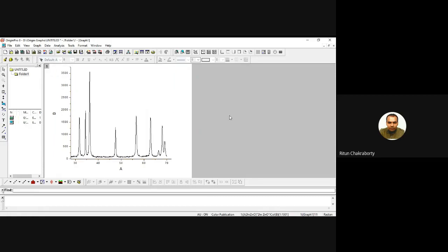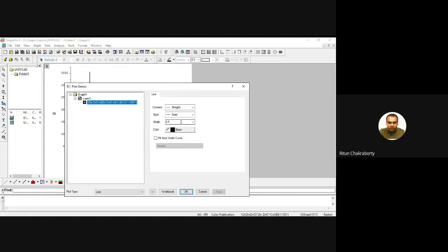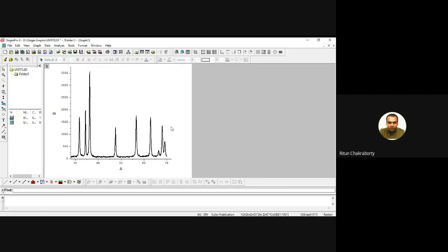Now make the plot lines thicker. Double-click anywhere on the plot — by default the line width is set to 0.5, so increase that to 3. The plot now looks thicker. For your reference, the x-axis is the angle two-theta and the y-axis is intensity in arbitrary units.